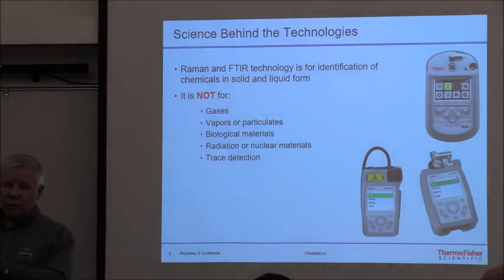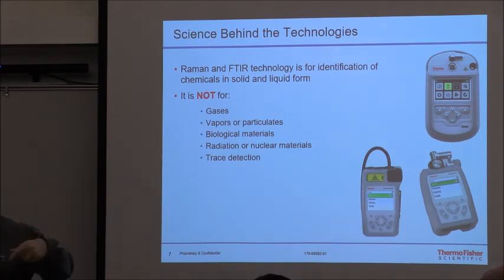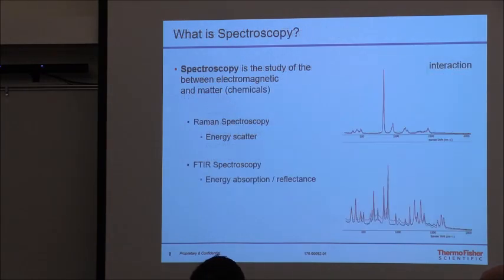But I know on visual inspection there's more than just chemical A in that mix. Okay, so keep that in mind, even if it's something like that, and that class of white powder, run it the second or third time, run it from a different point, collect different samples, and so forth. So that's how we want to kind of run that device. Oops, we can get hit that way, and so forth.